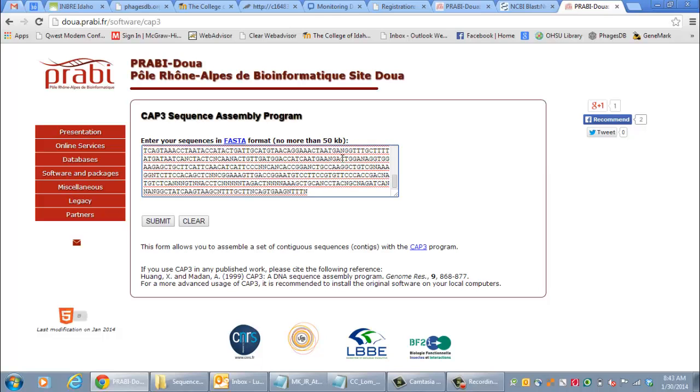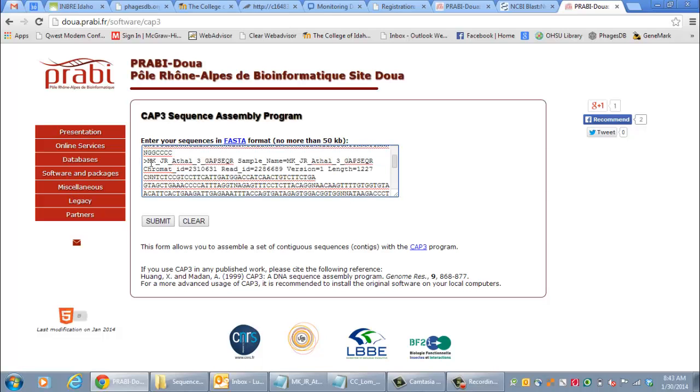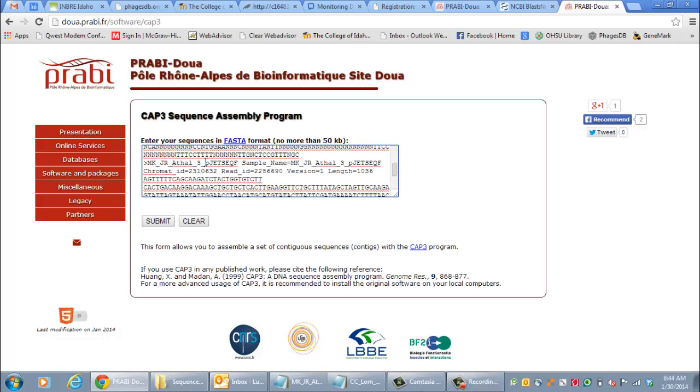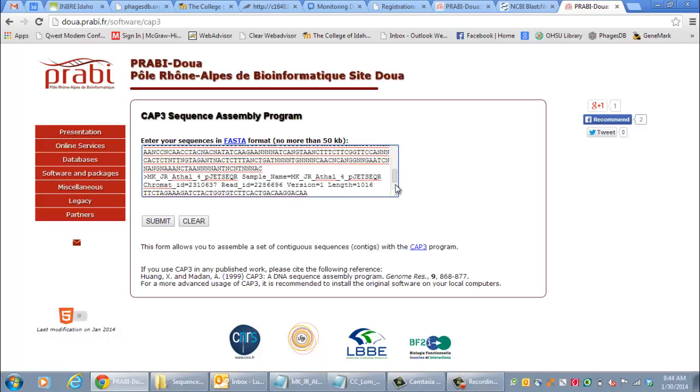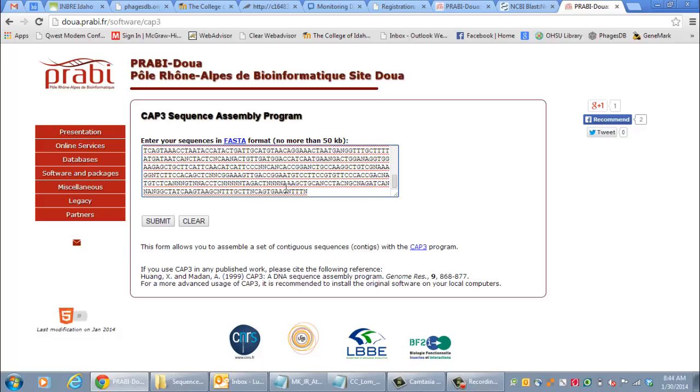So if I put all of those in together, then you should be able to scroll down it now and see the gap sequence forward primer, and you scroll down, and that one ends, and the next one starts gap sequence reverse primer, and you scroll down, and that one ends, and the next one, the PJet sequence forward primer that obtained that sequence read, and then the PJet sequence reverse primer that obtained that sequence read. And so now I've got 4 sequences in that represents one plasmid that we sequenced.